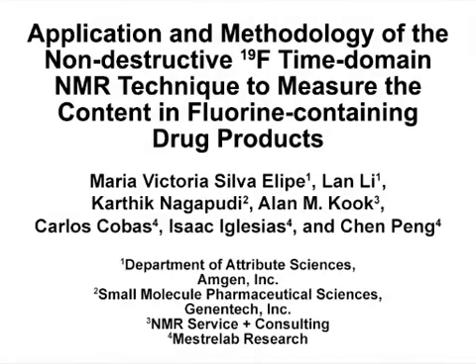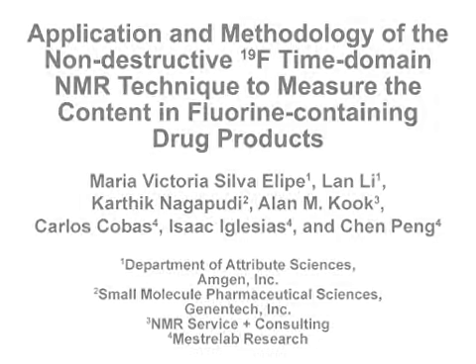The overall goal of this low-field fluorine-19 time-domain nuclear magnetic resonance methodology is to determine the average content of fluorinated drugs in formulated drug products. This is a non-destructive technique for drug development and manufacturing in the pharmaceutical industry.